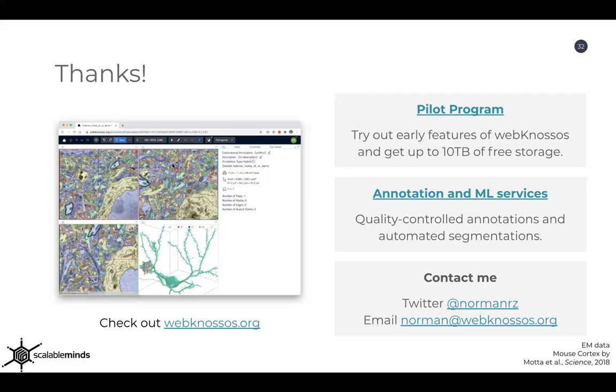And we also use it for error analysis at multiple stages, right? So for getting evaluation data, but then we can do some automated evaluation, and this will give us some errors, and then we typically load them into webKnossos to do some visual inspection to actually figure out what the errors are, do some error classification, and for that we find the tool very useful.